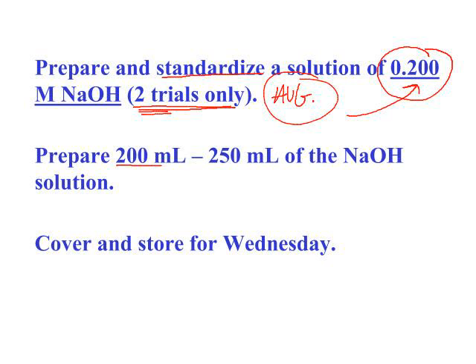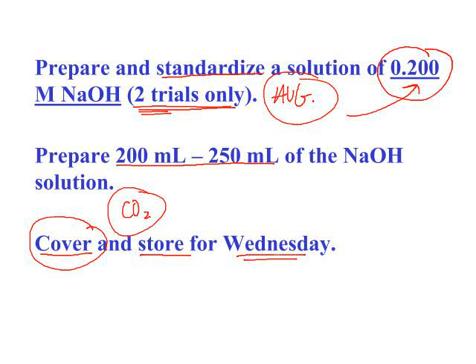You're going to prepare about 200 to 250 milliliters of the sodium hydroxide solution. You're going to cover and store it for Wednesday, and make sure that you cover it completely so that it doesn't absorb any carbon dioxide from the air.